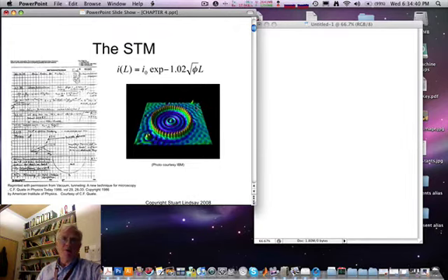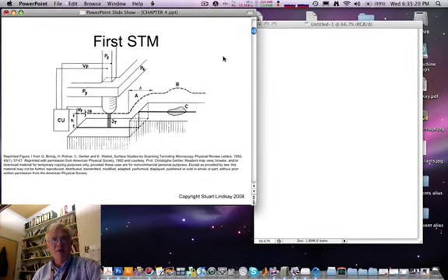The atoms were evaporated onto a very cold metal surface, and here you see the metal atoms on the surface. But inside the ring of iron atoms, you actually see the modulation of electron probability density as caused by the quantum mechanical interference effects of this quantum corral, as they called it. One is actually imaging quantum mechanics at work. So you can imagine the effect of this tool was so astounding, and indeed STM so easy to build, that for most people this was when nanoscience came onto the horizon.